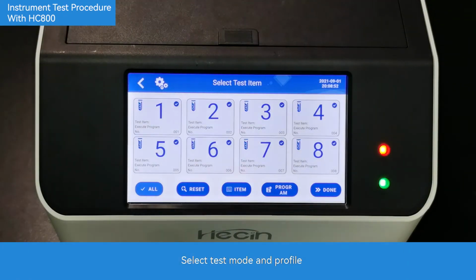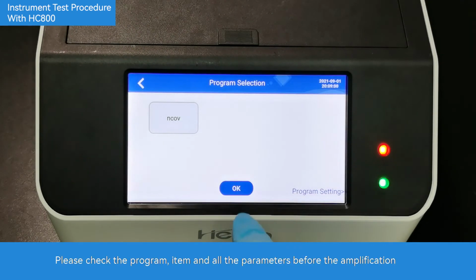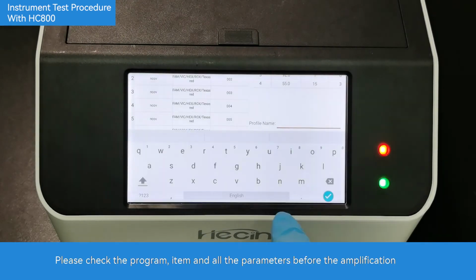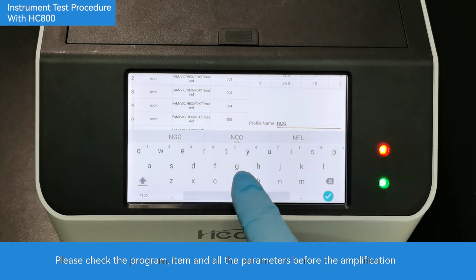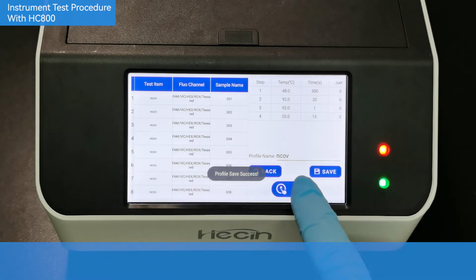Select test mode and profile. Please check the program item and all the parameters before the amplification. Then press Run to start the test.